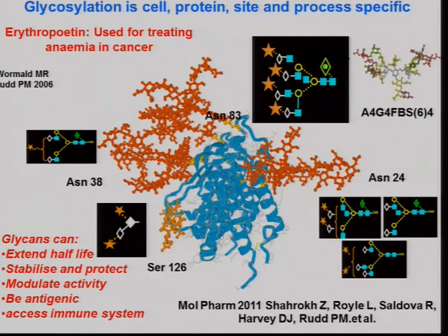Pauline, when you have set one condition and you have a profile, how reproducible is that over time? Robust, really robust. If you use the same conditions, you get the same profile. We've done it many, many times. And the other thing that we always do, we run the dextran ladder about every 10 runs, just to make sure that the plate count is staying the same and there's no shift in anything. The only thing that would change things would be if you used your column until it was dying and the resolution was very poor. Then obviously that's not a good idea. But that's not the fault of the technology. That's the wearing out of the column.